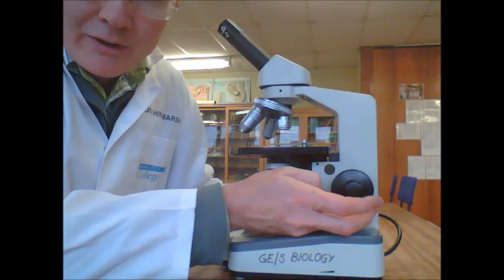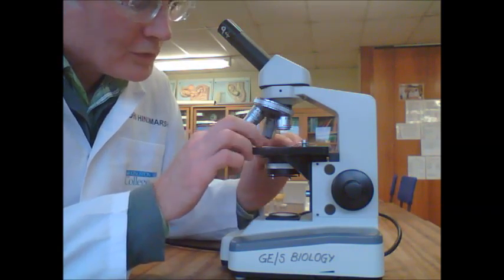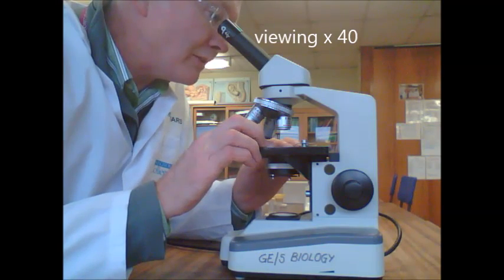Once you've found the focus, you can find what you want to look at and centralise it in the view.